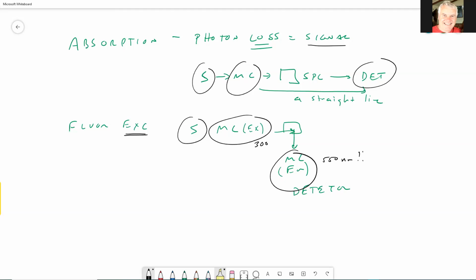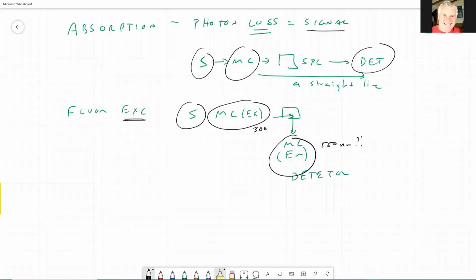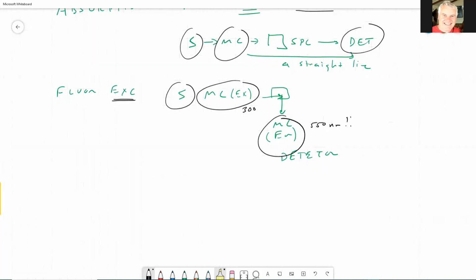So now, for the excitation experiment, as opposed to the emission one, is the excitation monochromator scanned or the emission monochromator scanned? Because in these experiments, excitation and emission, one is scanned, the other one is constant. So let me make a table here.